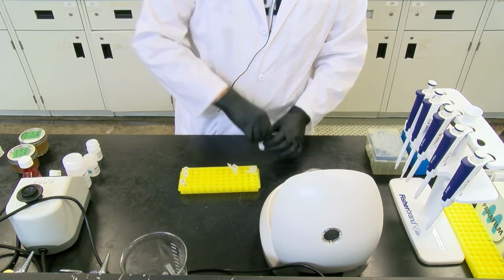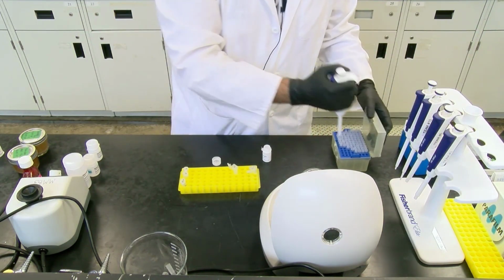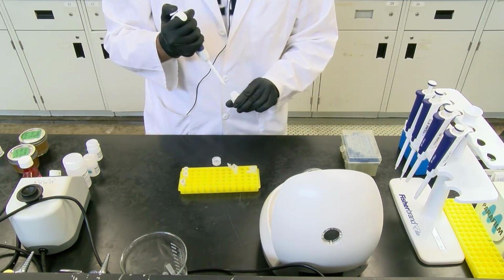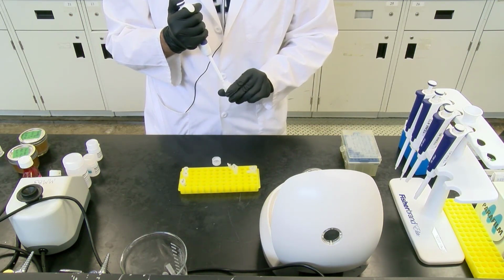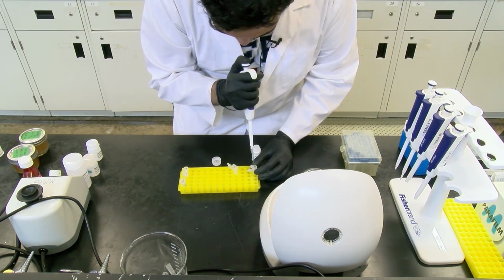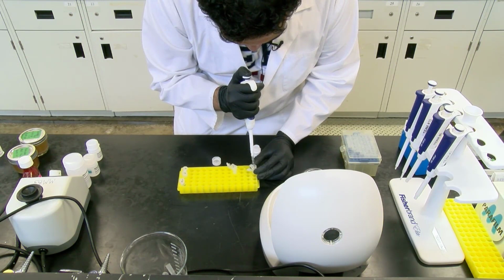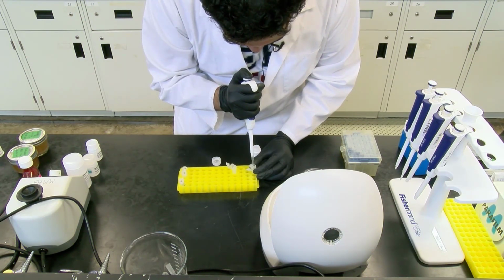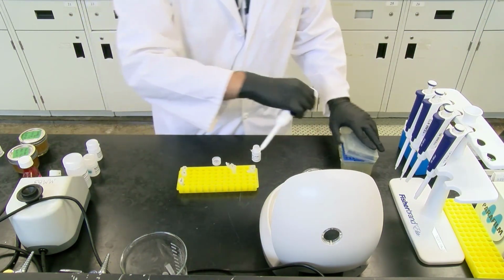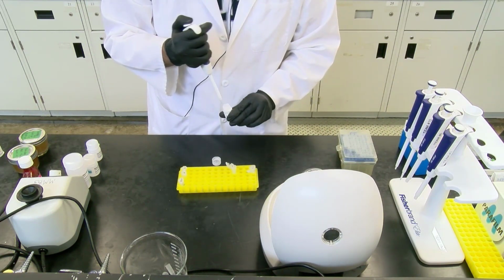So we're going to open this one and grab our pipette. And you're going to be very careful to try to put this in exactly in the center. Swap out your tip to reduce contamination. We're going to do it again for the second sample.